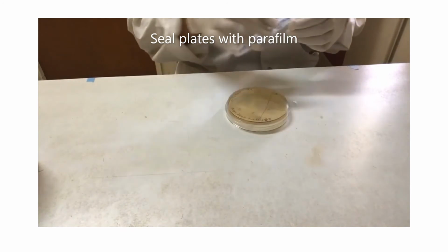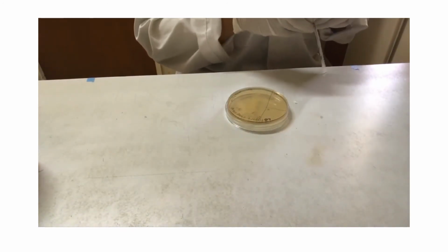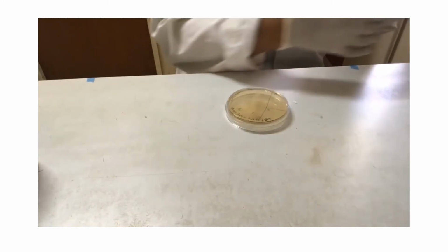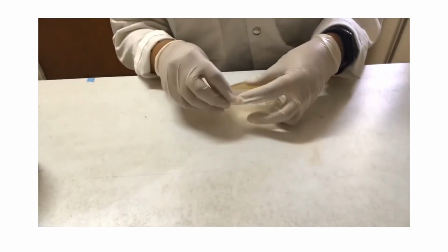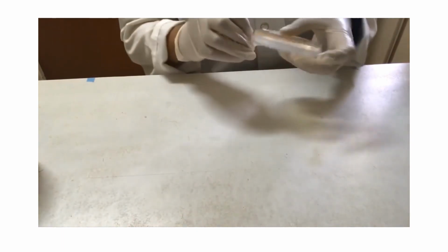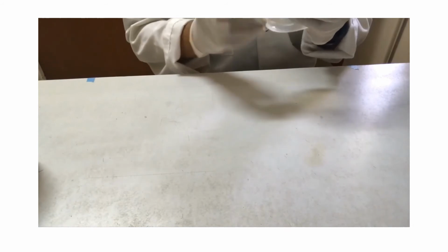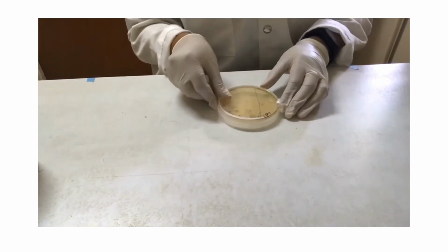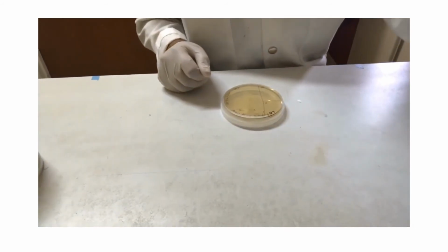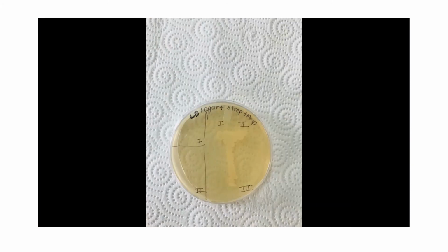The plate is then sealed with parafilm, inverted, and placed in an incubator at 37 degrees overnight. At this point, you should pause the video to observe the growth pattern on the plate.